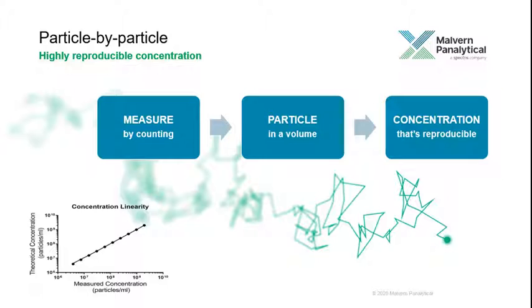Nanoparticle concentration is crucial for many applications, including environmental toxicology, biopharmaceutical and vaccine development, and drug delivery effectiveness, and is becoming an increasingly important parameter to regulators.